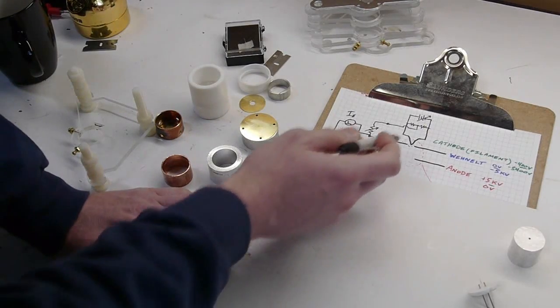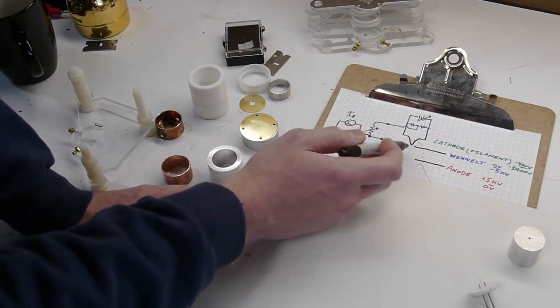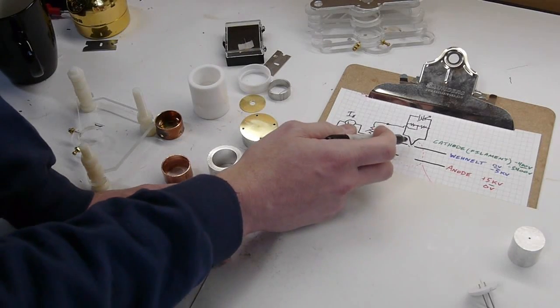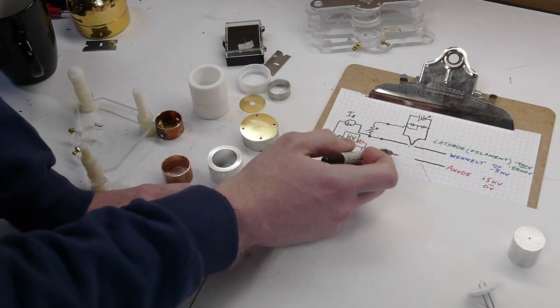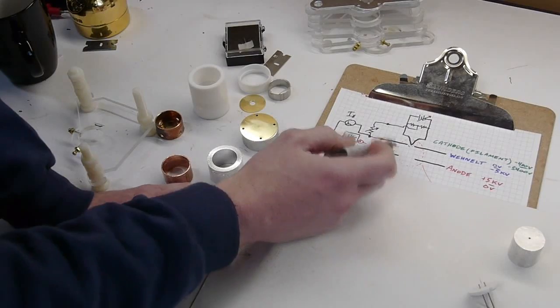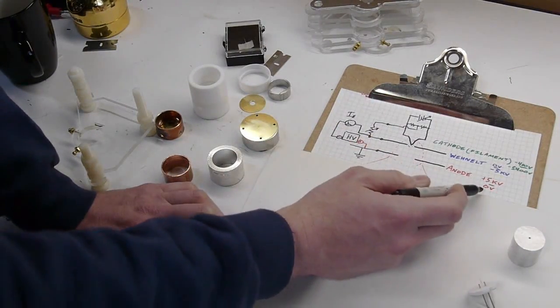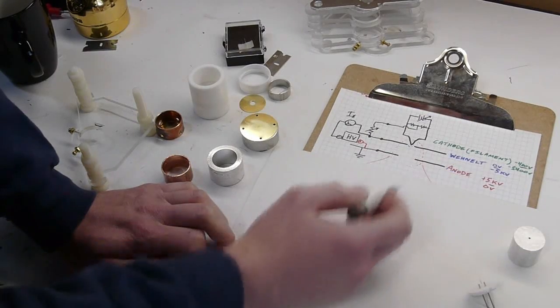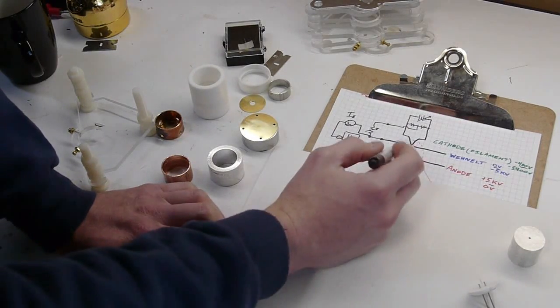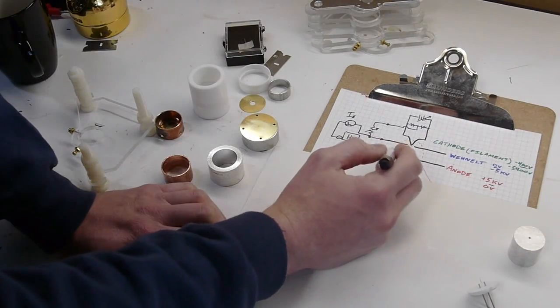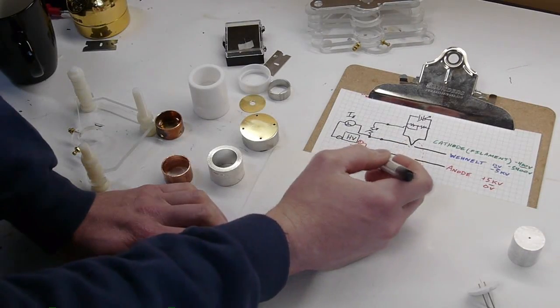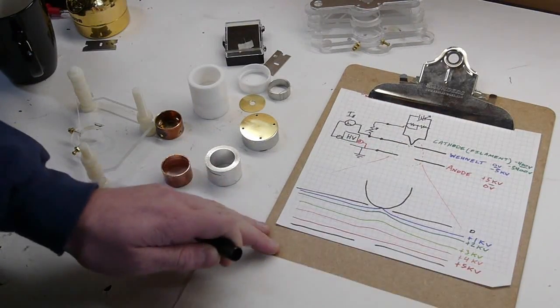So actually what's happening here is the electrons are liberated from the cathode and accelerated by the field, the electric field that's between the anode and the Wenelt. So if we're calling this anode 0 volts and the Wenelt is negative 5 kilovolts, there's a very strong electric field between these plates.